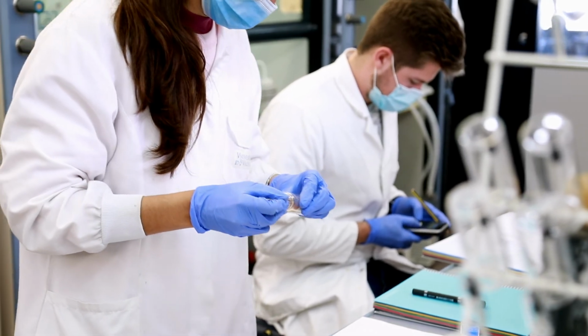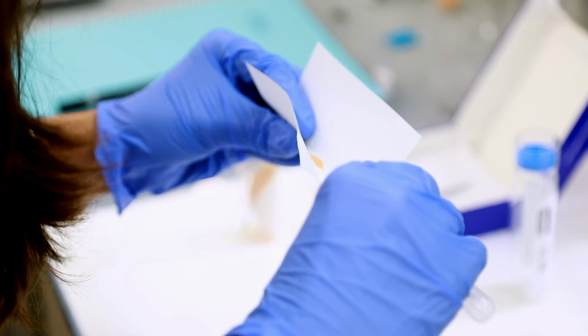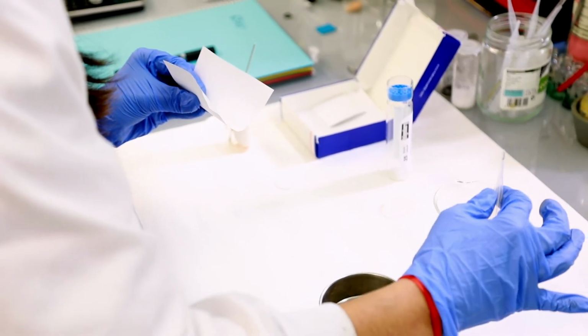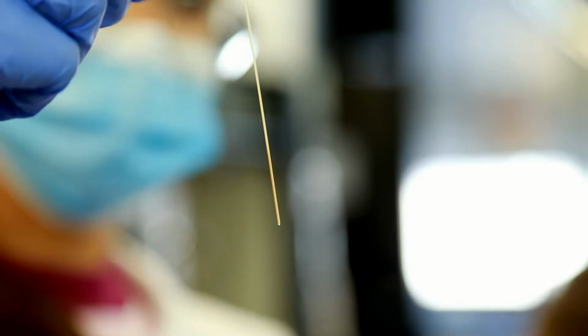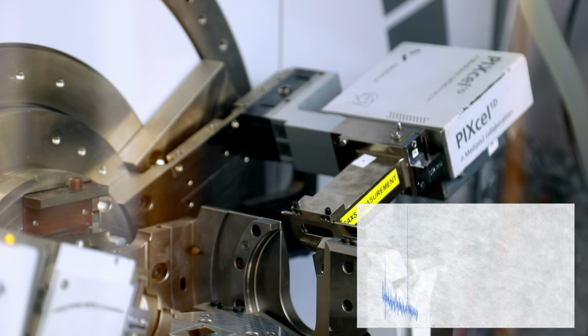X-ray powder diffraction can be measured with different setups. An important mode, because it uses a small quantity of material, is using capillaries. Once the capillary is loaded and centered, the diffraction experiment is analogous to that of single crystal diffraction. The beam illuminates the powder, and the signal is recorded by a detector which moves along 2 theta.